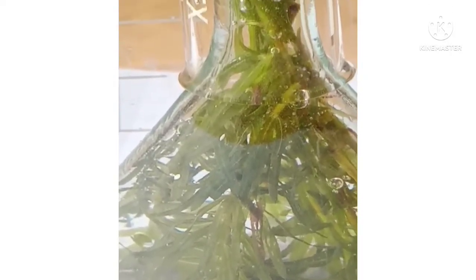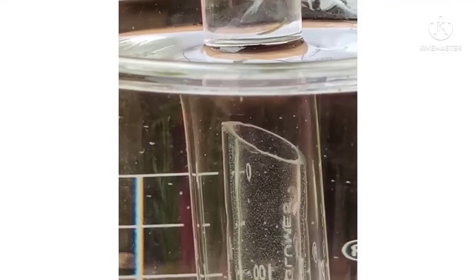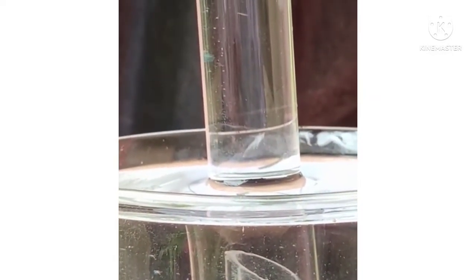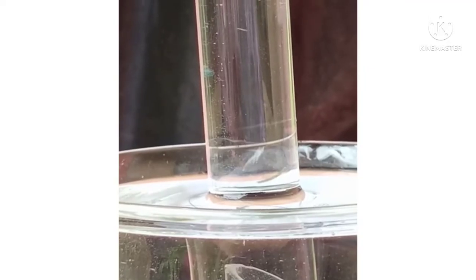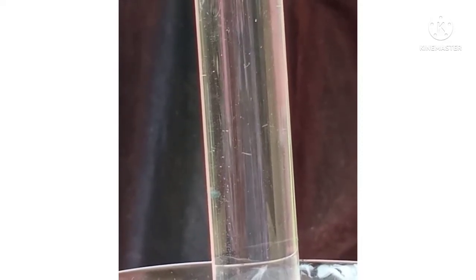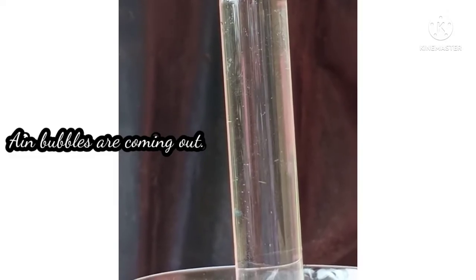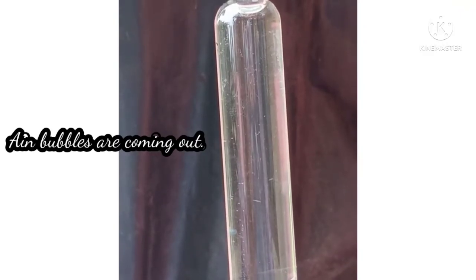The gas evolved during photosynthesis is oxygen. Air bubbles rise to the top of the test tube. In bright light, the air bubbles come faster, demonstrating the light reaction of photosynthesis. This confirms that oxygen is released as a byproduct during the light reaction of photosynthesis.